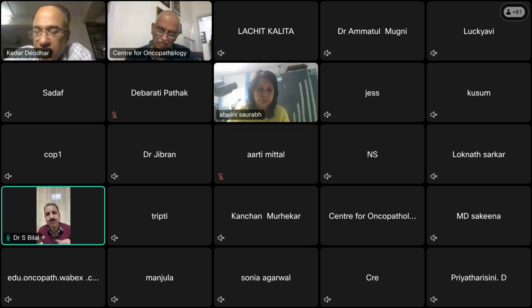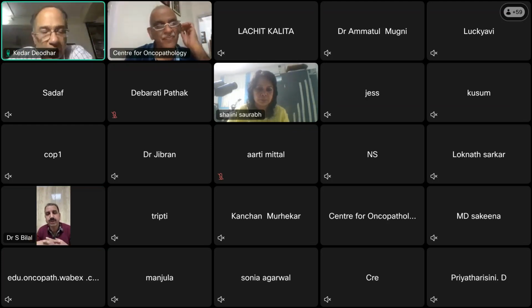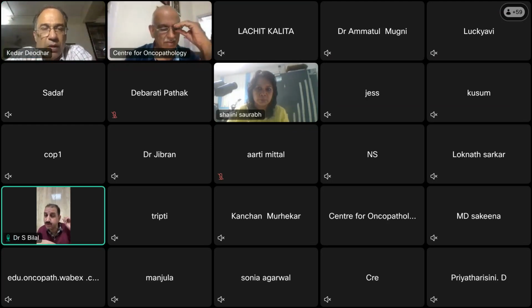I have the same practice. That also helps us, because sometimes I have seen a case in the stomach where at least 3 endoscopies and 3 biopsies were done, and 3 were inconclusive. After the 4th biopsy was taken, it proved to be malignant. Completely agree. These are some things we have to think about, to benefit the patient. Thank you, Dr. Bilal.